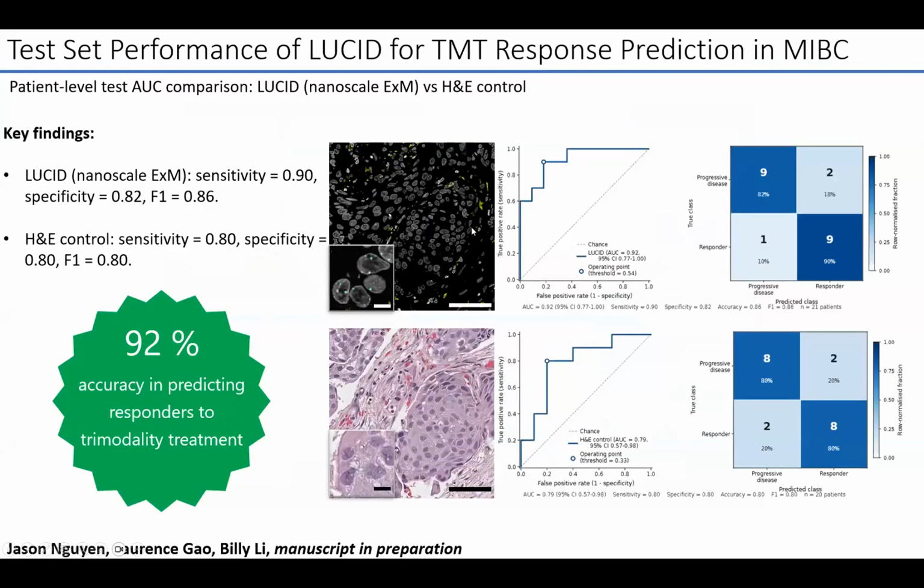It turns out that Magnify reveals some of the nanoscale features that allow the machine learning models to accurately predict the treatment outcome of those muscle-invasive bladder cancer patients.